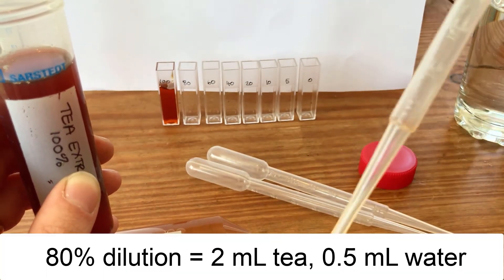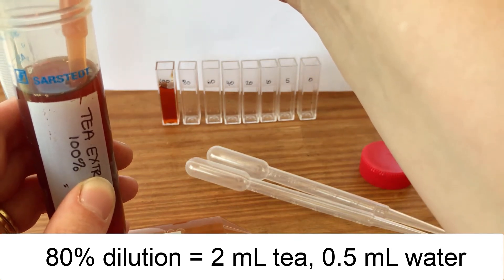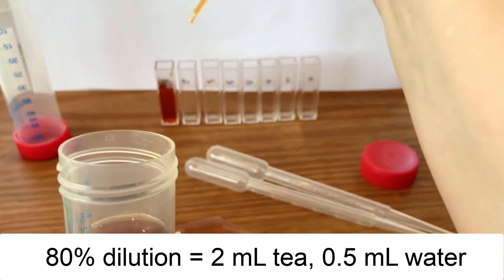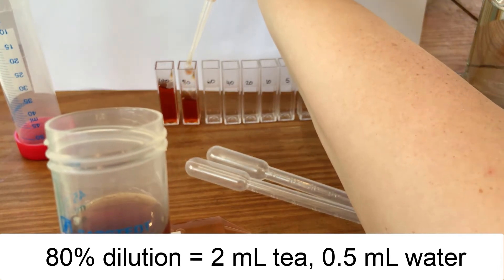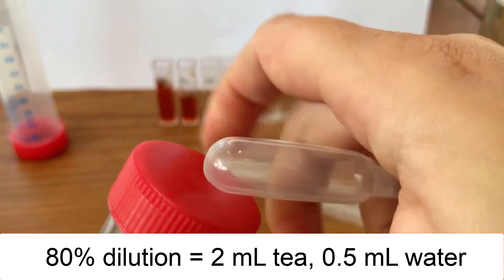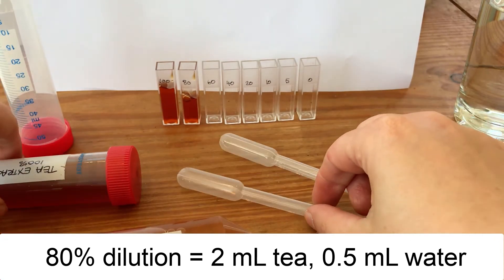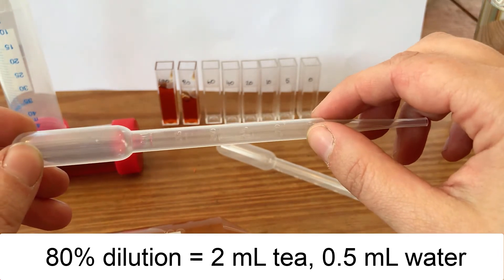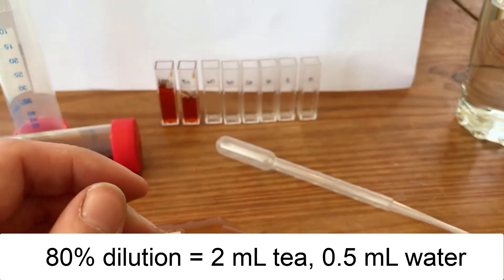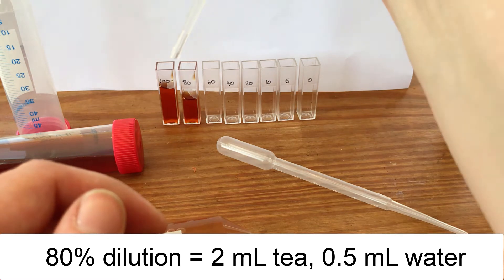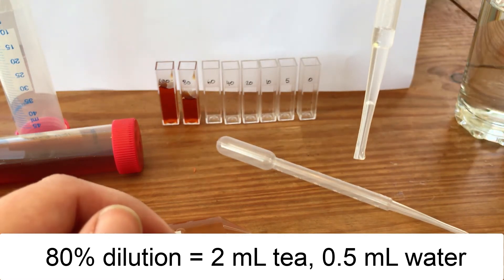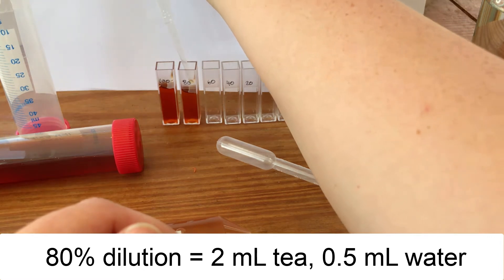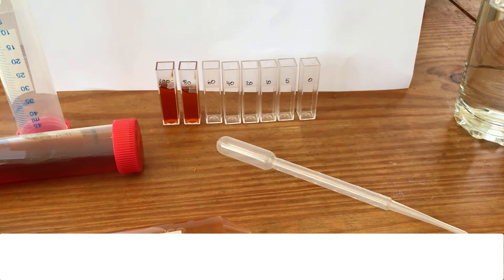So I'm going to take 2 ml, and again the more precise that you can be with this the better, so take it to 2 ml, you can just about see that on my pipette, and put that in the 80%. Then I need to dilute that with the water. We've got 2 ml of tea, four parts, so each part is 0.5 ml. So we had four parts which is 2 ml of tea and then I'm going to take 0.5 of water. You can see there I've got 0.5 of water, and again do this as accurately as you can so the meniscus is in the right place, and add that to my tea. I'm just going to push that down so that should hopefully be a little bit more dilute than the hundred percent.